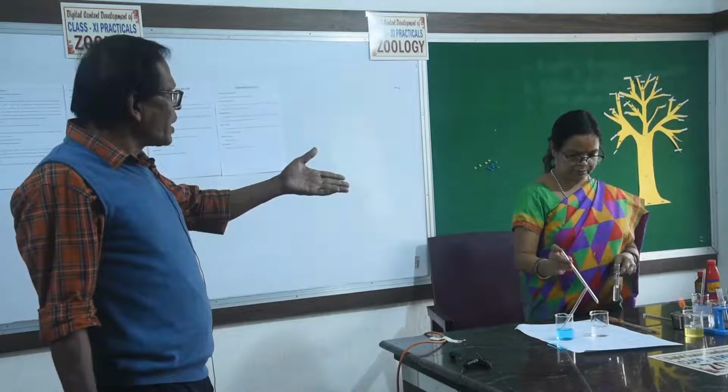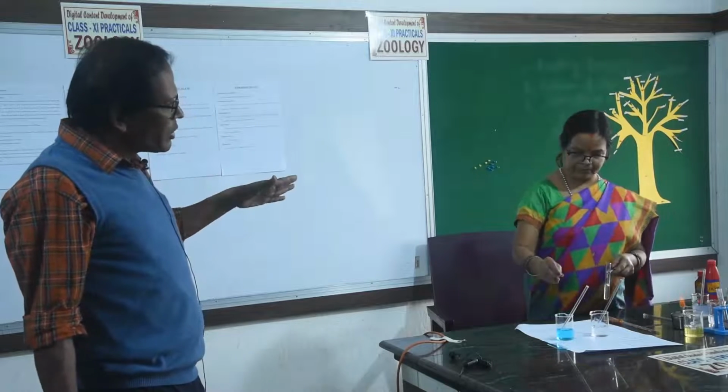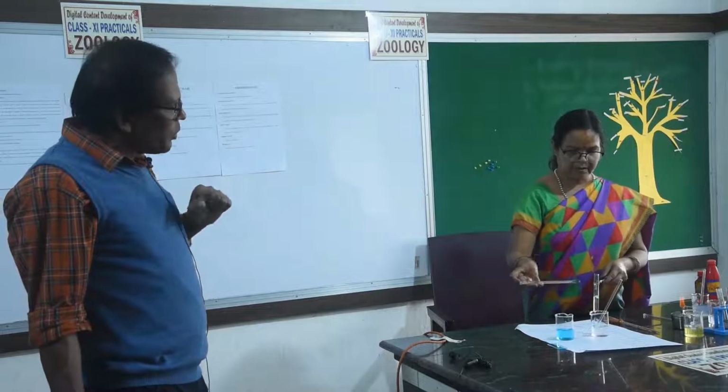Yeah, ma'am, you add sodium potassium tartrate? No, only sodium hydroxide and the copper sulfate.